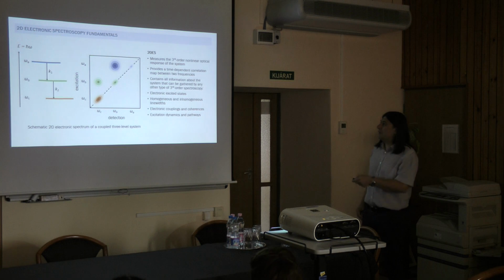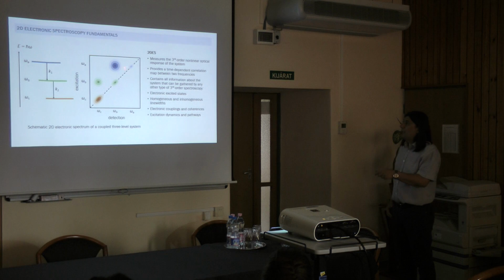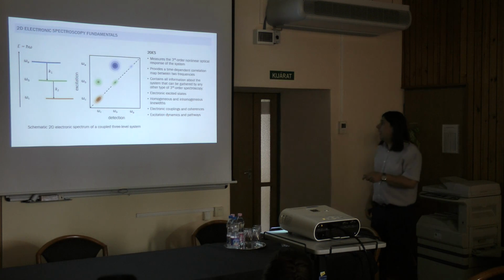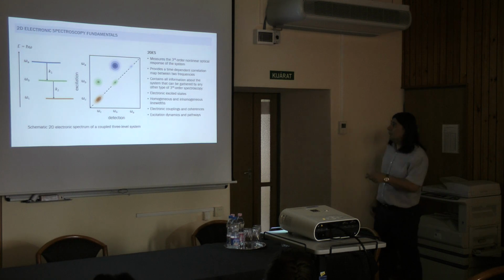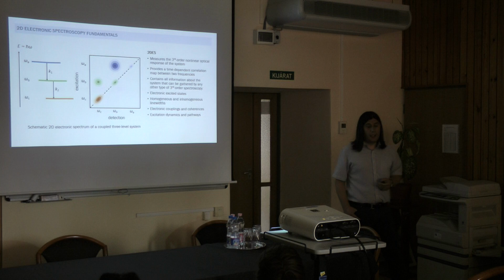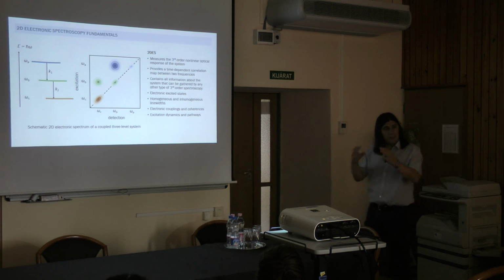We have molecules with excited states, and these states correspond to some energies, and they will correspond to some peaks in the two-dimensional spectra, and they will tell us information about these states, about their energies, line widths, homogeneous and inhomogeneous, and more importantly, the couplings between the levels, which are here in these cross peaks, and it can tell us about coherent dynamics, population dynamics or excitation dynamics, pathways, connectivities in the system.